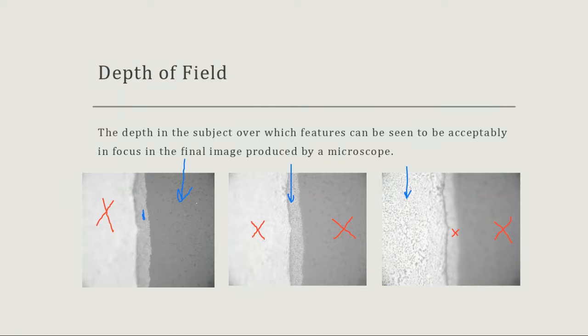Okay, so what am I looking at? Well, what I'm looking at in this case is the dark gray feature you see on the right. This is a ceramic. C for ceramic. The center section, this little piece right here, is a tungsten coating.